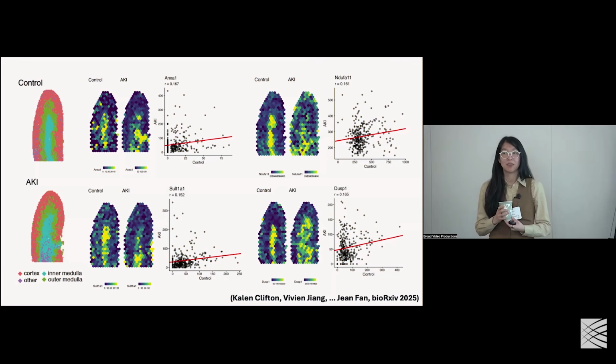If I really did have multiple samples, practically what I would likely do is first identify the genes that are consistent within conditions. So perhaps if I had two controls, I want to find all the genes that are positively correlated and have the same spatial pattern in the controls, and all the ones that have the same pattern in the disease setting, and then only test those in a pairwise manner, perhaps.